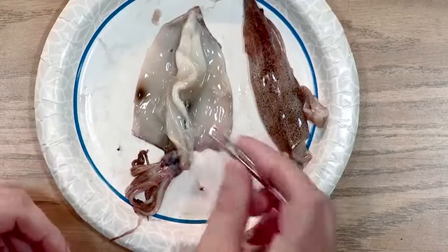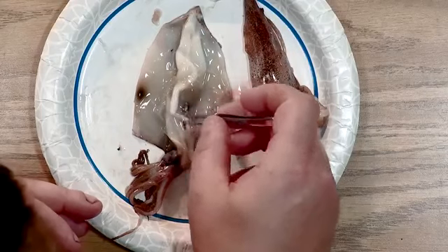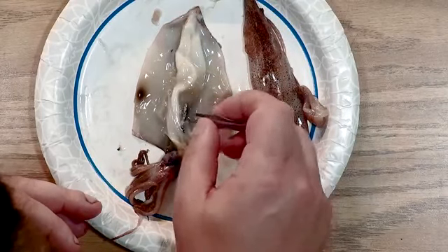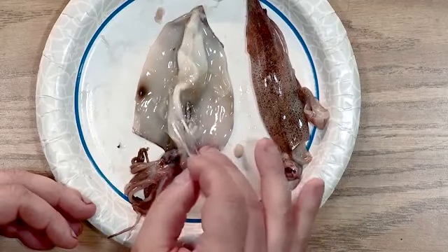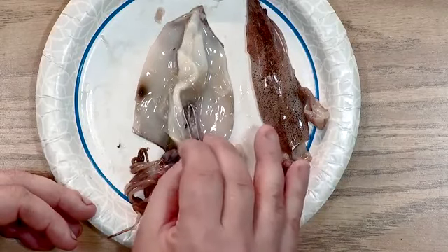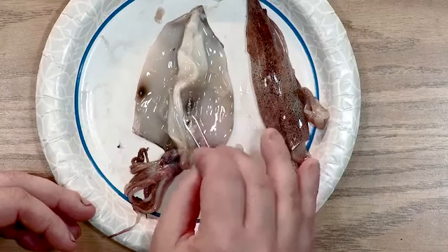First thing I want to point out, we talked about the ability to have the ink. Well, right here, I'm going to move this piece out of the way. You can see a shiny, once again, I'm going to use that word, iridescent or metallic looking object. And that is the ink sac right here.